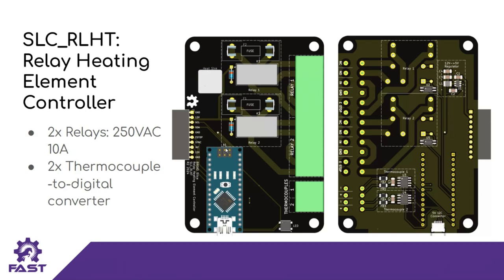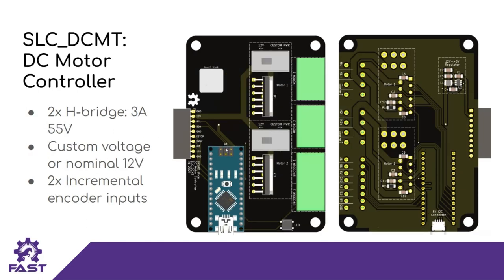All of the slices have a four-letter indicator which tells you their functionality. This is RLHT, the relay heating element controller. On it are two relays which can host a heater up to 250 volts AC and 10 amps, and then two thermocouple-to-digital converters for temperature sensing, so you could control two heaters with this slice. Next is DCMT, the brushed DC motor controller. On it are two H-bridges, so you could host a DC motor up to 3 amps and up to 55 volts. You can choose to use either a custom voltage up to 55 volts or the nominal 12 volts from the loaf to control your motors. There are also two optional incremental encoder inputs for precise position control.